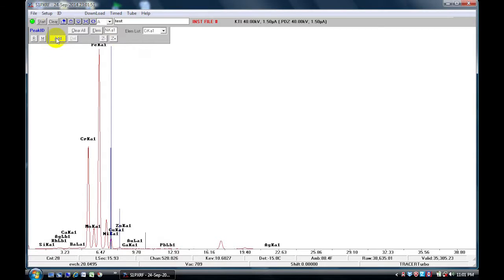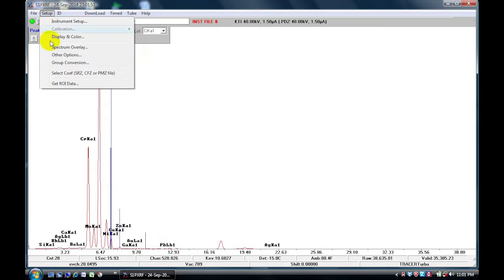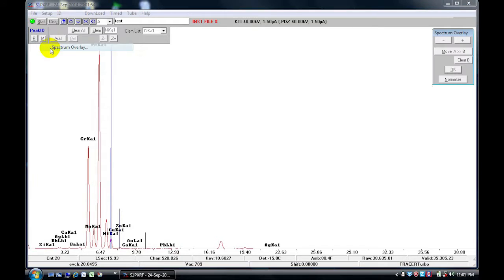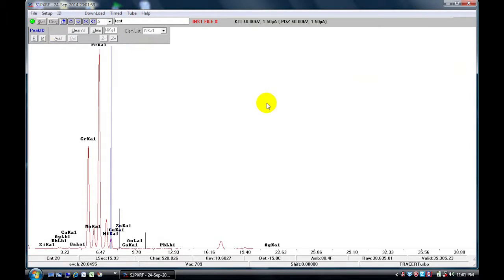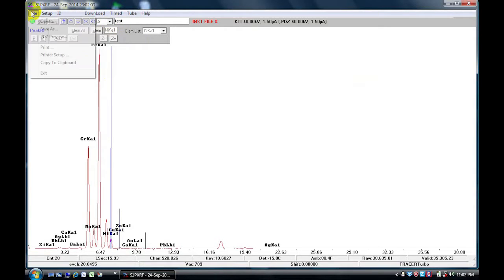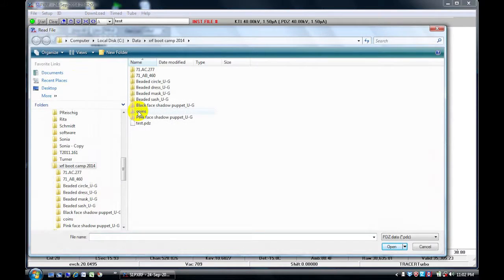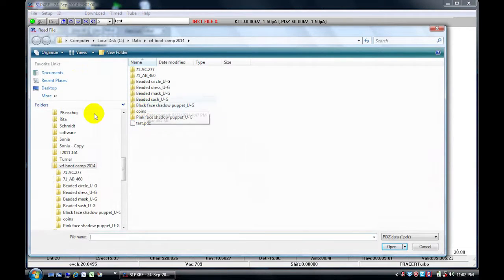To overlay, you need to go to Setup, Spectrum Overlay, and then Clear B. Hit OK. Now you go to A, File, Open, and open your file of interest.